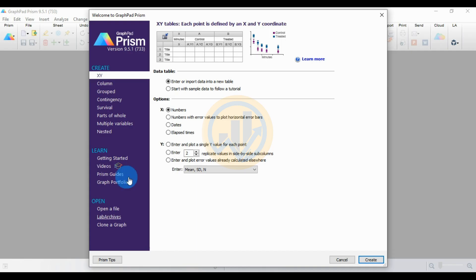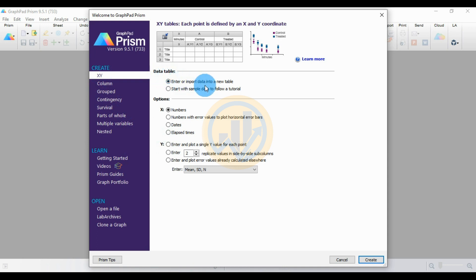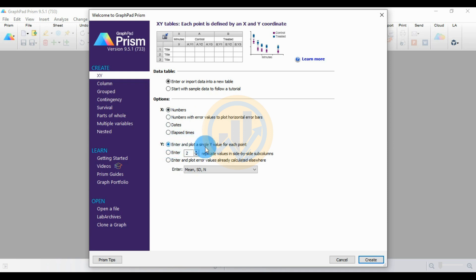In GraphPad Prism, first create a new table by choosing the XY option and selecting data table for entering input data. Set the X options to numbers and the Y options to the first option — entering a single Y value for each point. Then click the Create button.